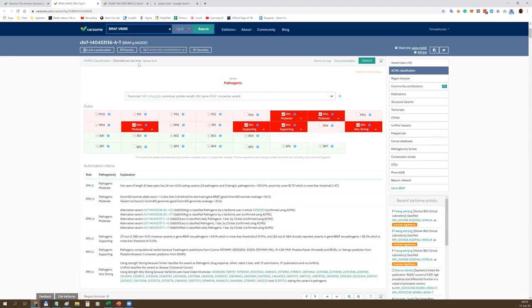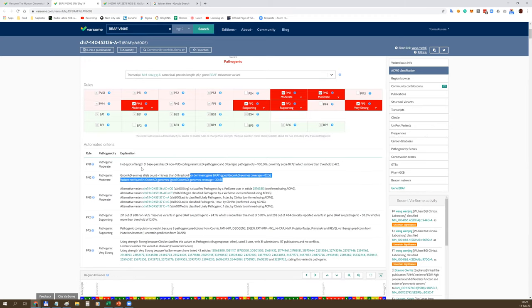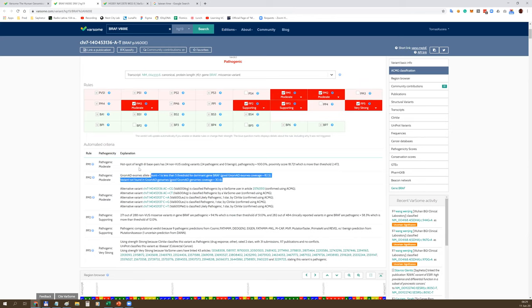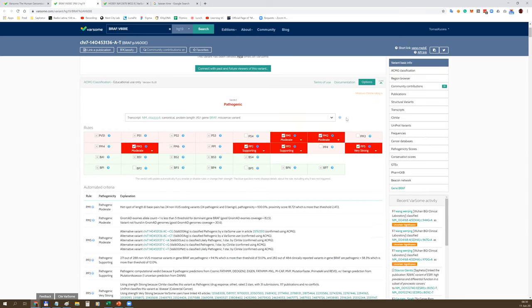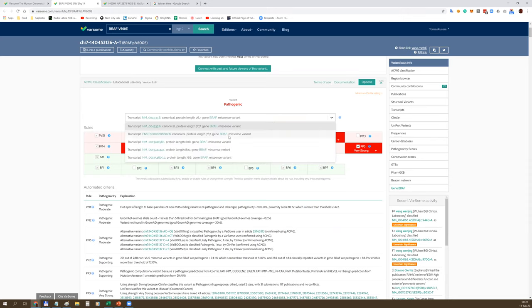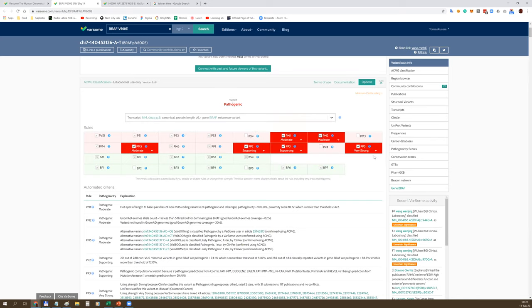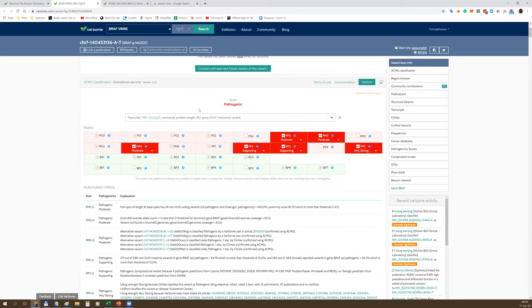In this case, you can see that six criteria fired based on the evidence coming from all these annotation data resources. Varsom's implementation of ACMG guidelines is very solid and robust. It's also very transparent because every criterion is explained in great detail in plain English - why a given criteria fired or did not fire. This allows you to review every particular criteria and make your own judgment call.